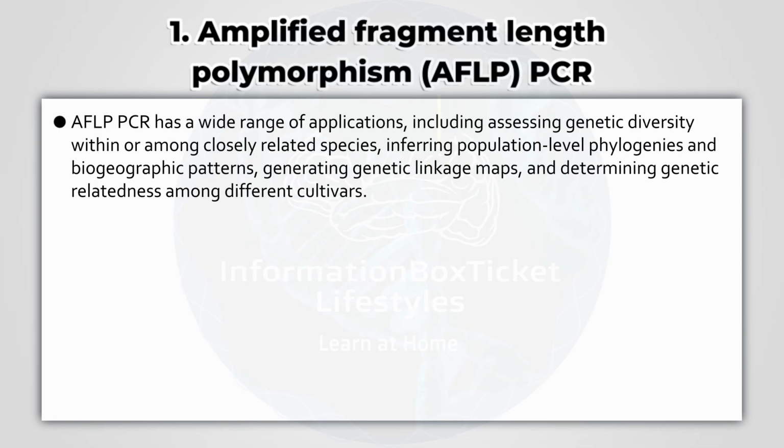AFLP PCR has a wide range of applications, including assessing genetic diversity within or among closely related species, inferring population-level phylogenies and biogeographic patterns, generating genetic linkage maps, and determining genetic relatedness among different cultivars.